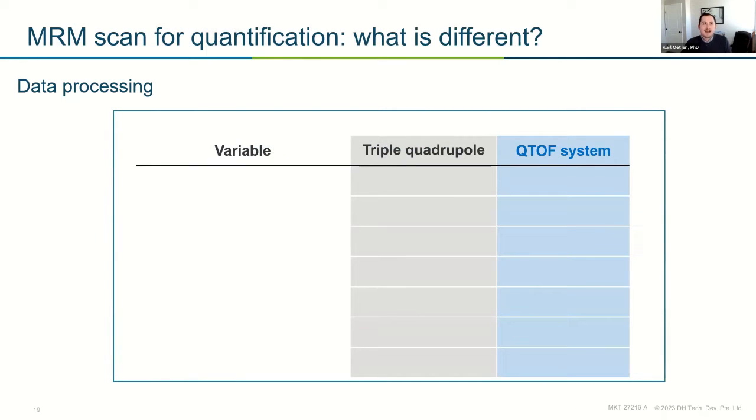So if we take a step back and think about what data we have to be confident with in nominal mass, we have things like the MS/MS data, like I just said, which is something we have on a QTOF, which is great. We have our retention time, still really important, right? We use that to be, again, confident that this is our compound of interest. And we have things like ion ratio. So we know the difference between a quantifier and a qualifier ion. We can get a ratio of that and be pretty sure, yes, this is what I'm looking at.